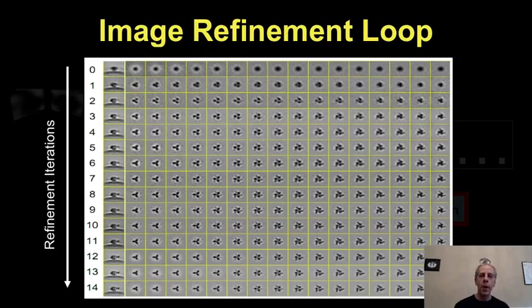Things start to appear, and you start seeing shapes. You didn't see anything, and after iterations you start seeing shapes because you are progressively improving your alignment, improving your classification, and then we know that if we average things that are the same, the noise goes down, and then we can get the shapes that we wanted.